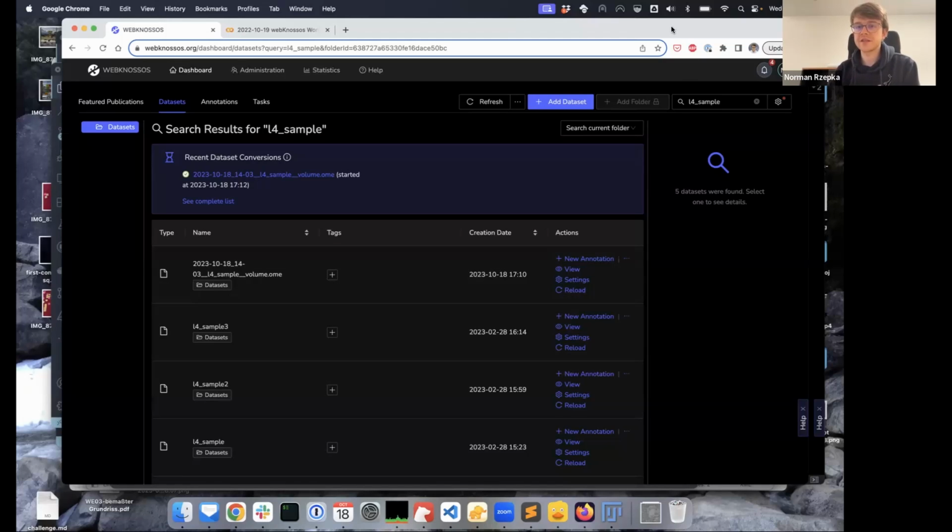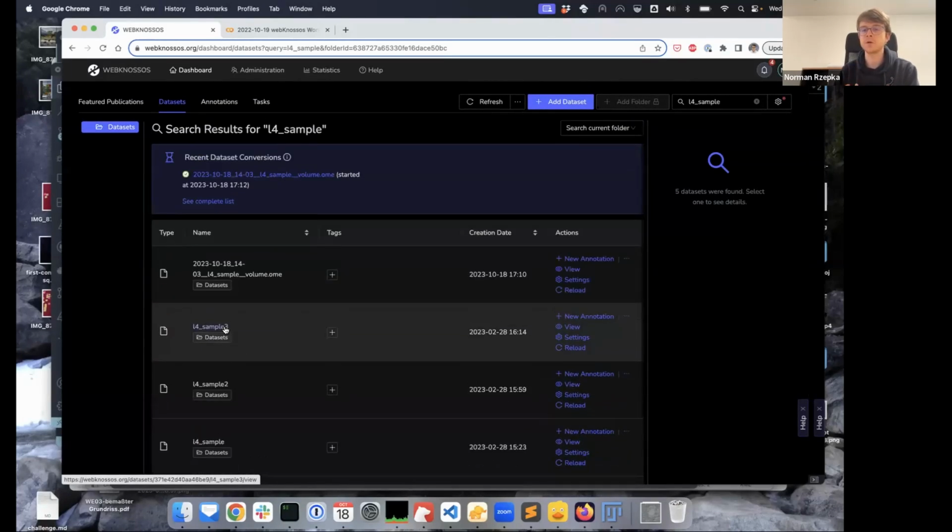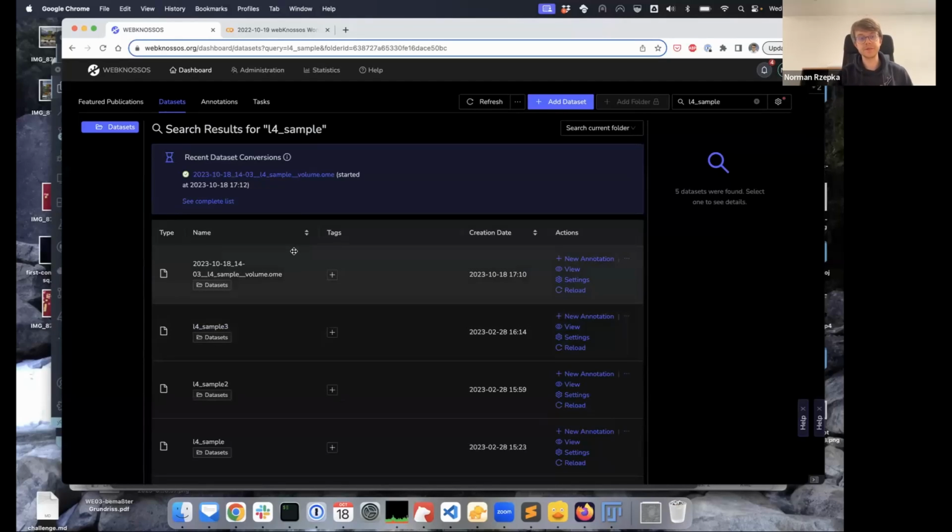So once you have an account and you're logged in, this is one of the screens that you will probably interact with the most. It's the dataset list. I now already have a couple of datasets here that I use for demo purposes. When you open it up for the first time, it's probably empty.